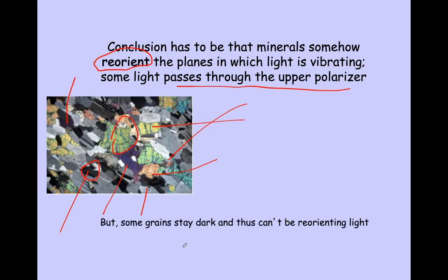So some grains remain dark. That means they cannot reorient the light. Okay, right.